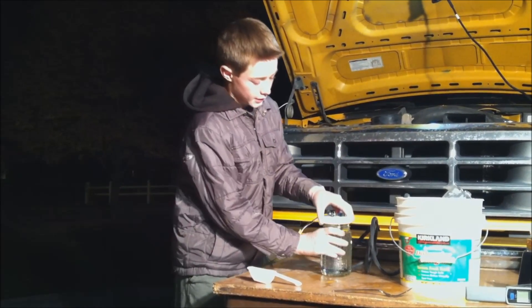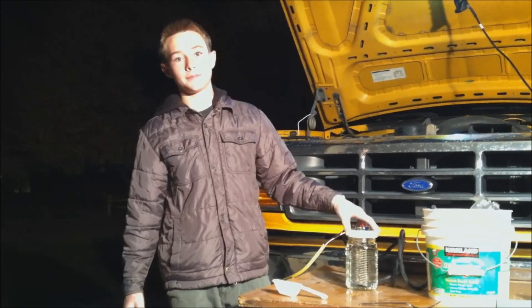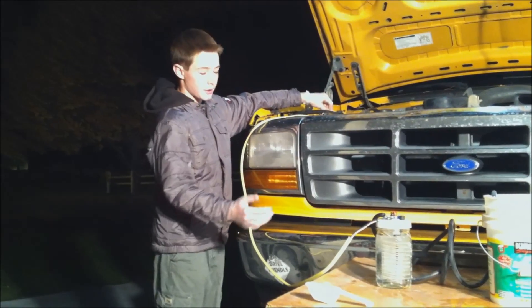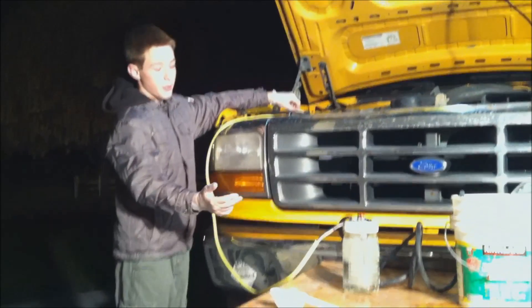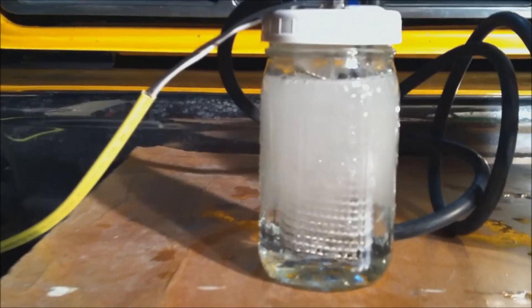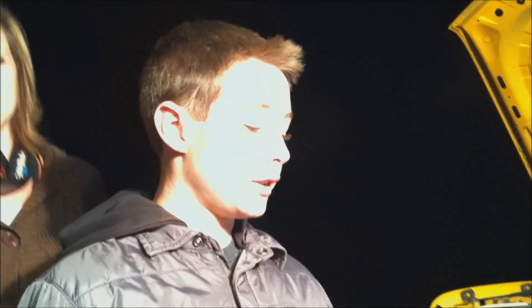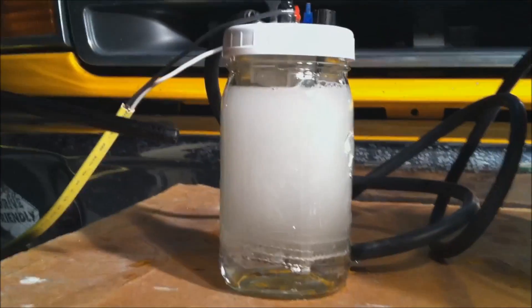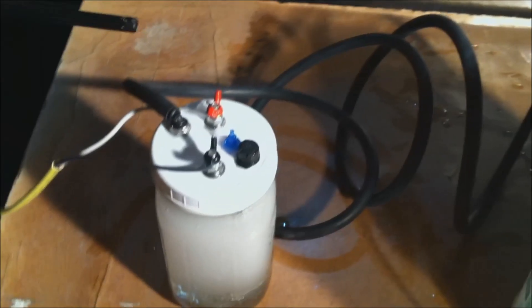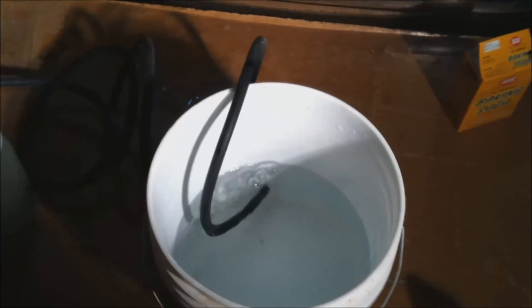Now that we've mixed the chemicals, we're going to connect this to the battery and that's going to start electrolysis. As I connect this, the hydrogen is starting — those bubbles are the hydrogen, which is the fuel. The process is happening; the bubbles are coming up and forming, coming through this tube and into here. Now to prove that it's a reliable fuel source, I'm going to light it up.